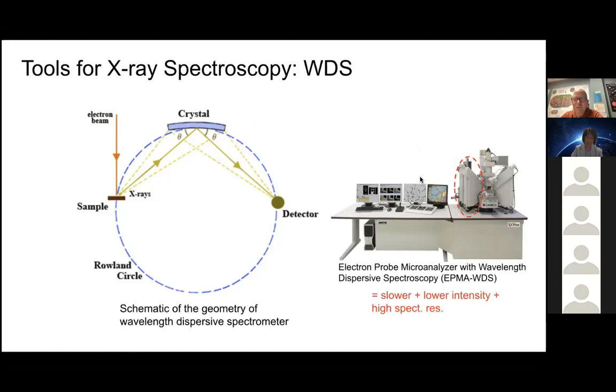The advantage this gives is a much higher resolution spectra of what the elemental composition of a given mineral is. So we can determine with much greater precision the chemical composition of a small area within a mineral, and we can analyze up to 5 different elements at the same time, and then we can change positions of the spectrometers to gain information on other elements.